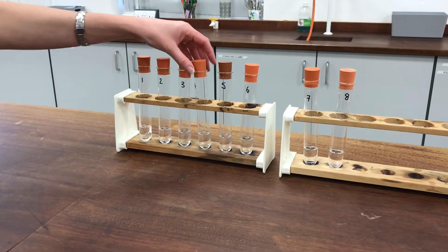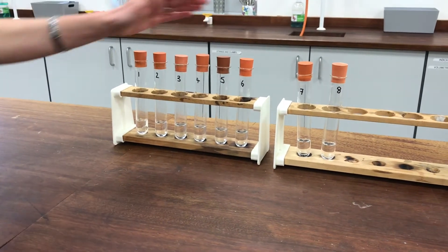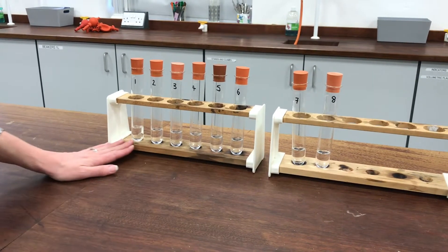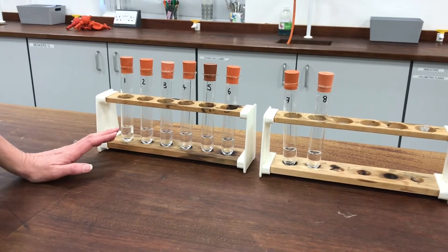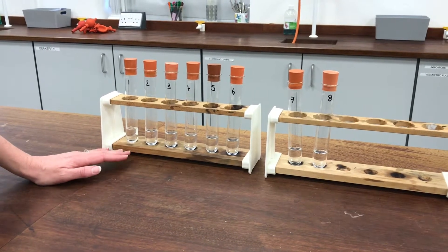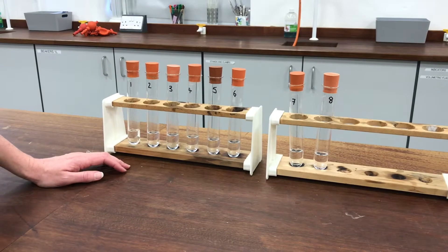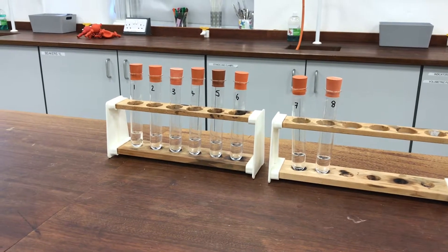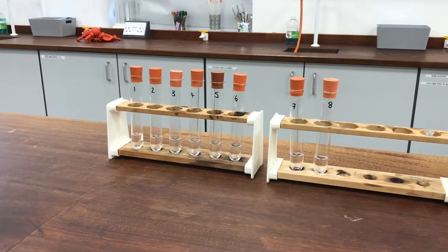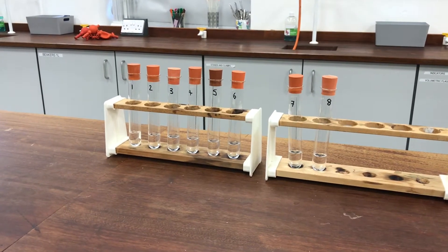I'm about to titrate these equilibrium mixtures that I set up last week so that I can determine how many moles of acid are in those solutions at the moment. You'll remember when we set them up, we put 5 millilitres of hydrochloric acid in there to start with. So I need to first titrate my 5 millilitres of hydrochloric acid so that I can subtract that from any value I get, to negate the effect of the hydrochloric acid.